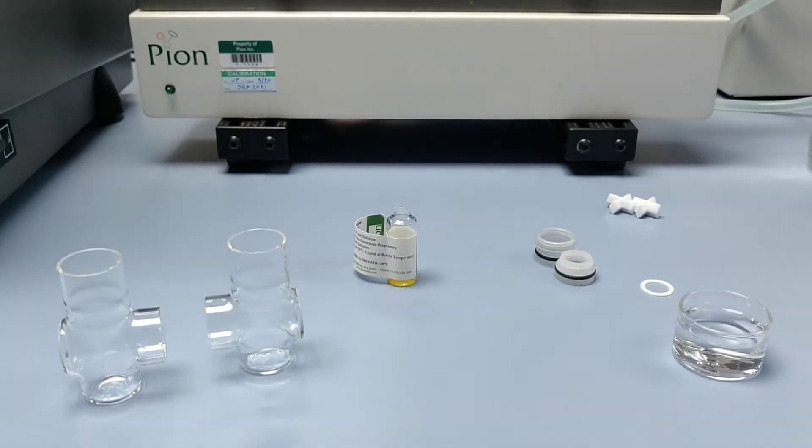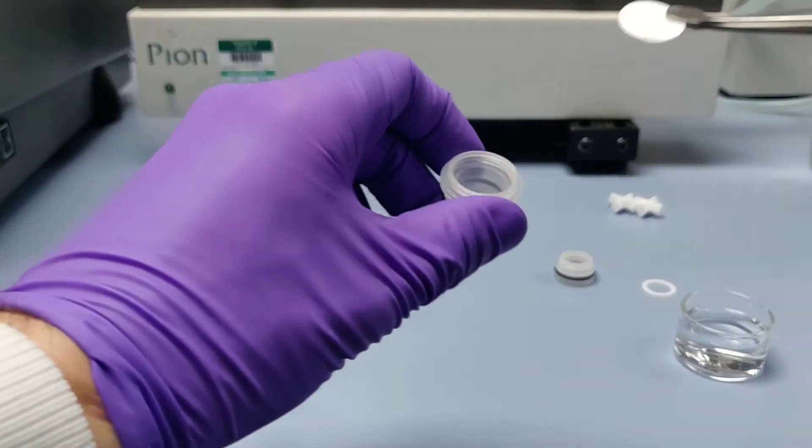Assembly starts by placing the membrane into the female half of the membrane holder. This is done wearing clean gloves and using tweezers. It is important to ensure that the membrane remains clean and free from oils from the skin.